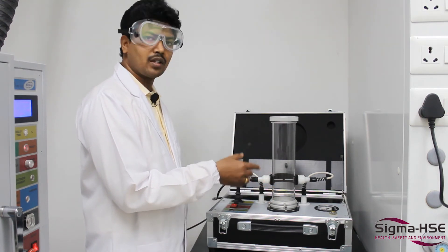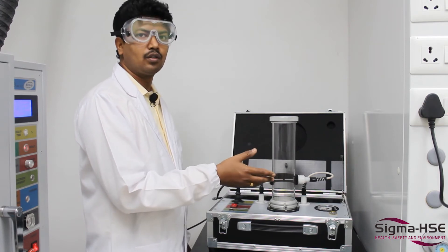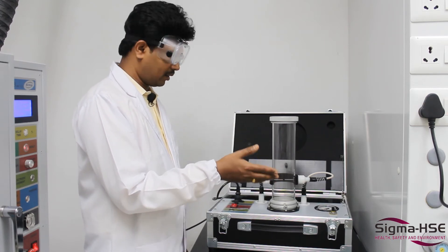Group A determines whether your dust is flammable, Group B determines whether your material is non-flammable. Hope you guys had a good visit at our flammability testing laboratory.